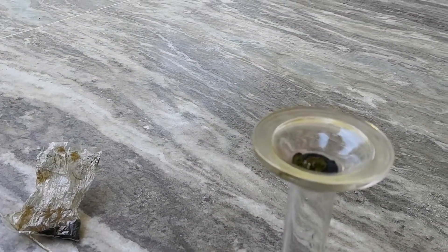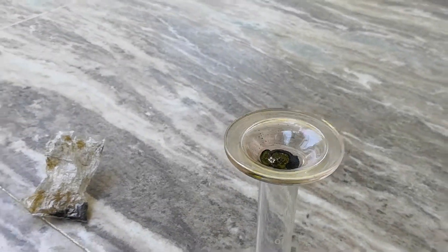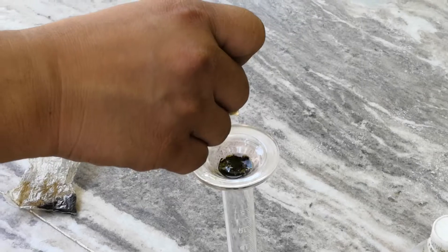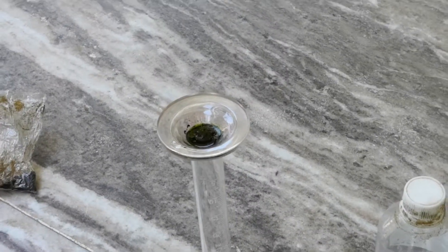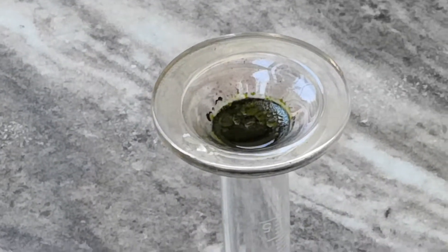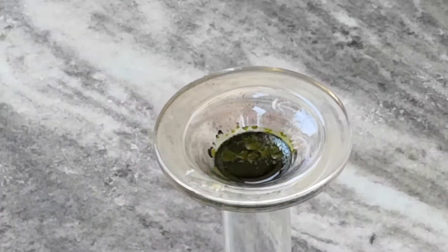It will try to react with each and every organic thing it comes in contact with. As you can see, it's already caught a little bit of fire, because the source of potassium permanganate can be a little bit impure sometimes and can contain some organic materials as well. There we go — you can see the green colored liquid which is actually manganese heptoxide, now that it's made.